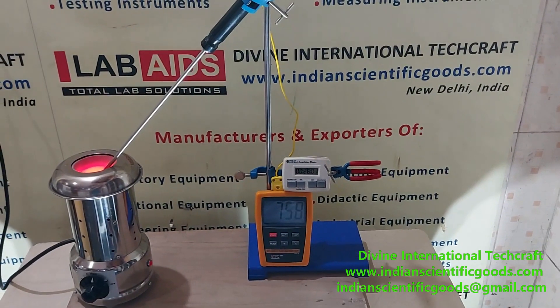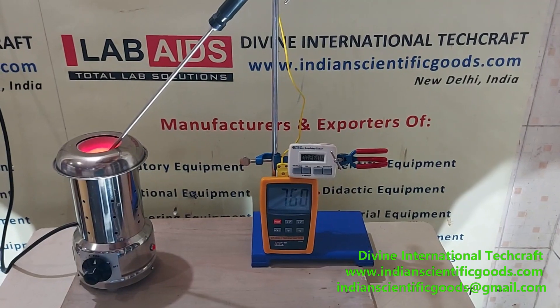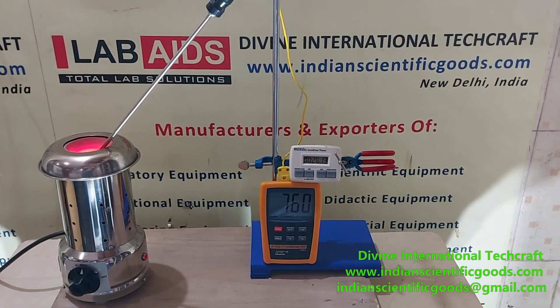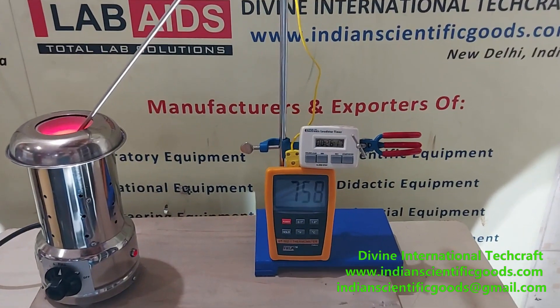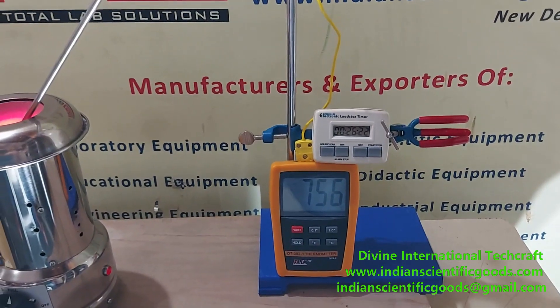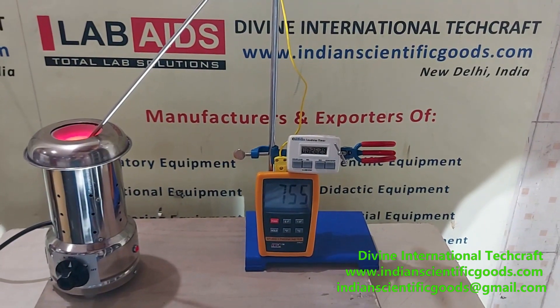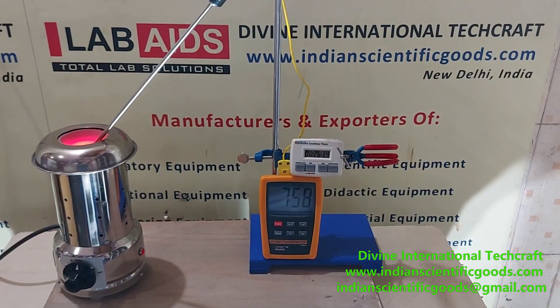We hope that you will find this demonstration and performance that you have seen today of this electric Bunsen burner useful. We will wait for your inquiries and orders for these electric Bunsen burners manufactured by Divine International Techcraft, New Delhi, India. Thank you.